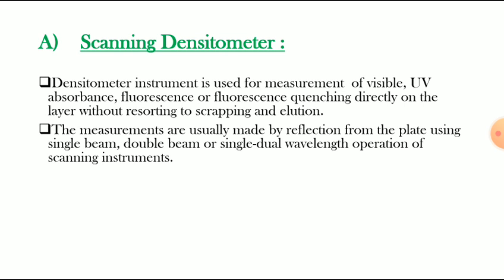The measurements are usually made by reflection from the plate using single beam, double beam or single dual wavelength operation of scanning instruments.